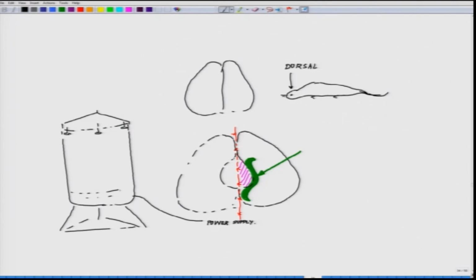Here you keep your stuff, and there is a pressure gauge which ensures the pressure, and from here the water creates the vapor. So, in a high pressure and vaporized environment, you sterilize the stuff.